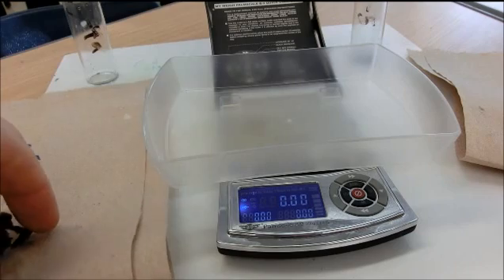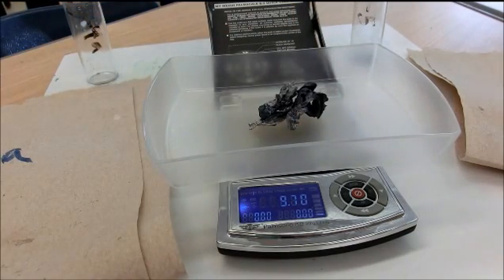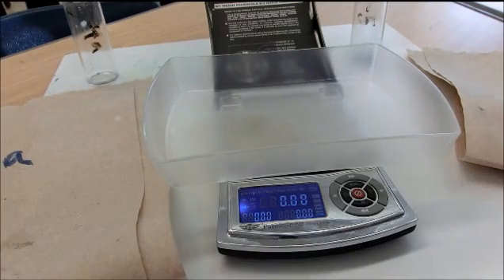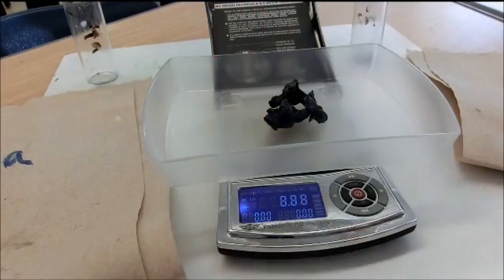Here are the chunks of zinc for my 3B4 class. The mass of the chunks of zinc are 9.70 grams. For the 4B5 class, the mass of the zinc is 10.82 grams.